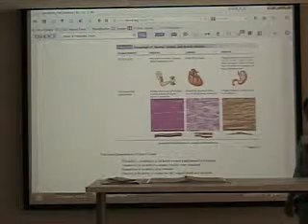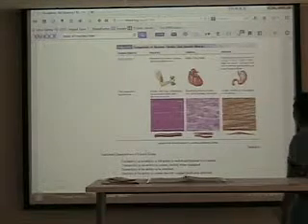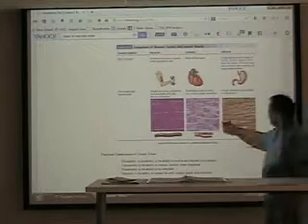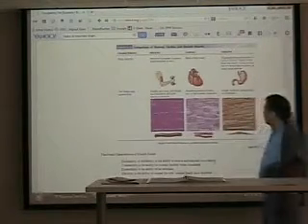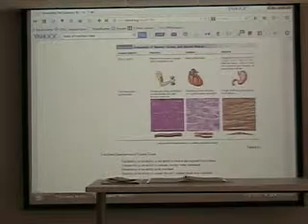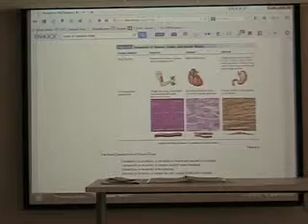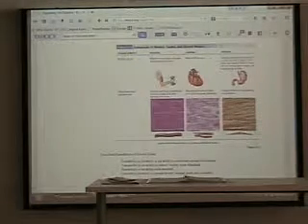Another thing that's really characteristic about your cardiac is these little lines here. That's a dead giveaway that those are intercalated discs. Okay, and you can check in your notes on what is the function of an intercalated disc.